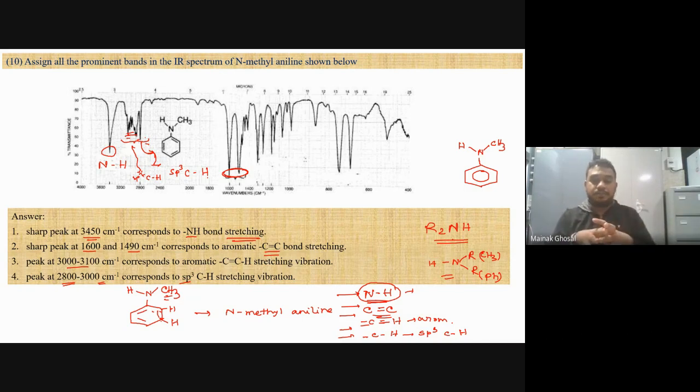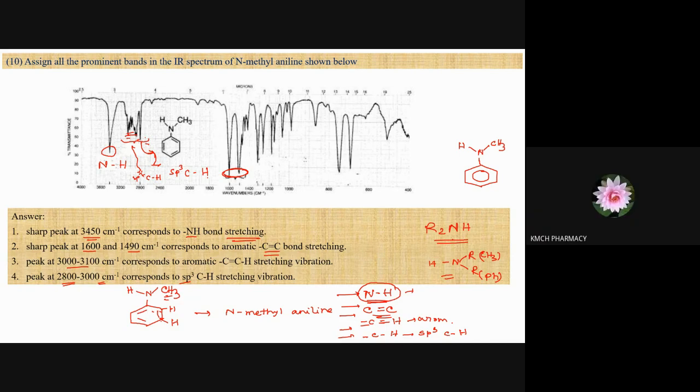You need to see whether a particular light is absorbed or not. I need to meter that I want this wave number of light and see if it is absorbed. That is why you need a monochromator after the sample has absorbed the light. You have got the point? I'm not clear, sir.